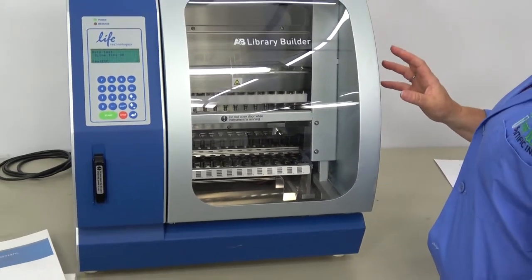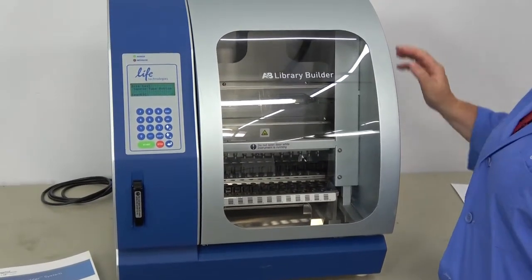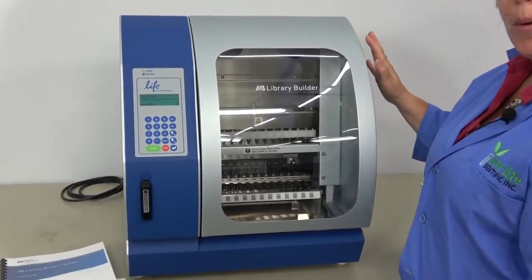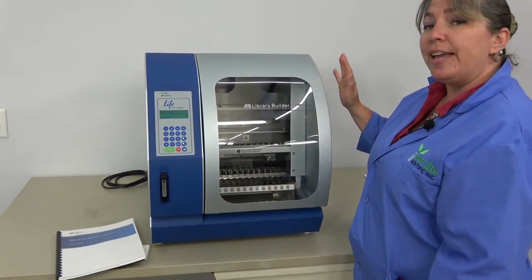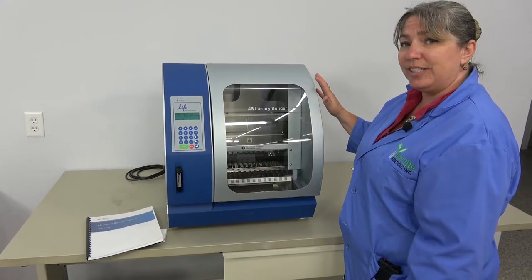It is a fully integrated nucleic acid purification instrument. This item has been fully checked out by our in-house technicians. It is backed by our 90-day warranty and we have it on hand in our Cridersville, Ohio facility.